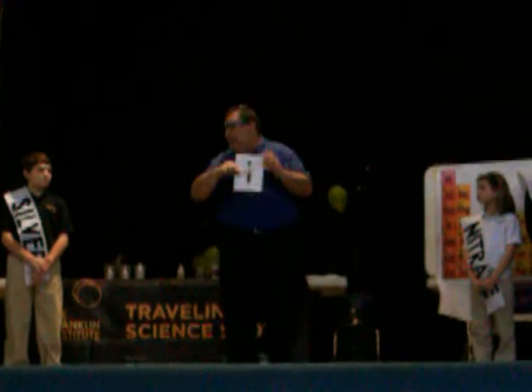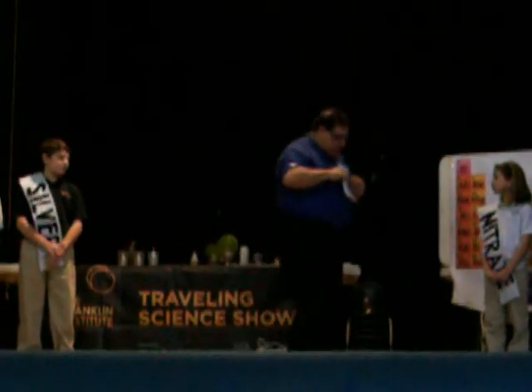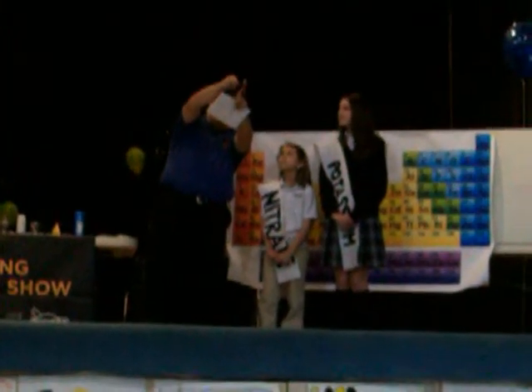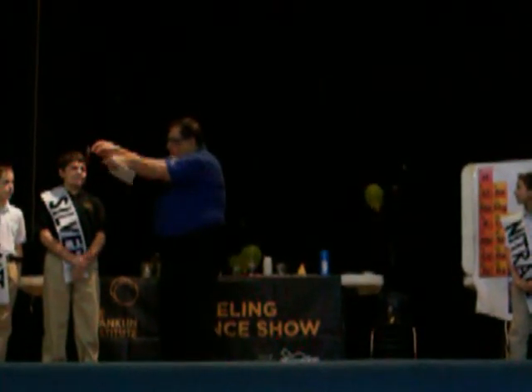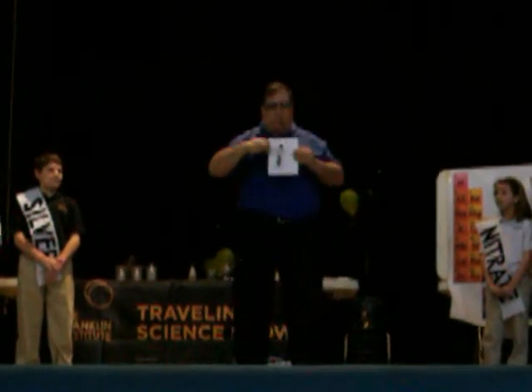And if I wanted to collect that silver chromate red chemical that's falling to the bottom, here, look, if you just look at the test tube, can you notice that it's a little bit darker red at the bottom than it is at the top? Can you see that already happening? A little bit darker red at the bottom than it is at the top? That's because this red silver chromate is sinking or precipitating to the bottom.